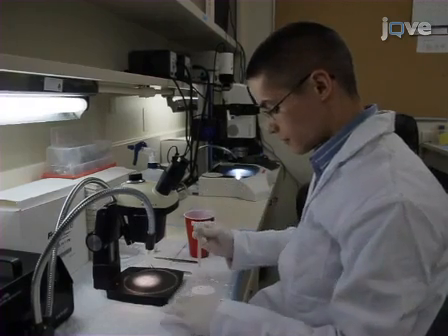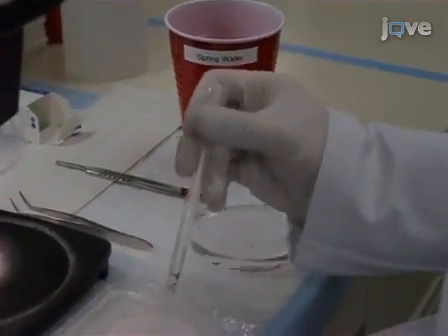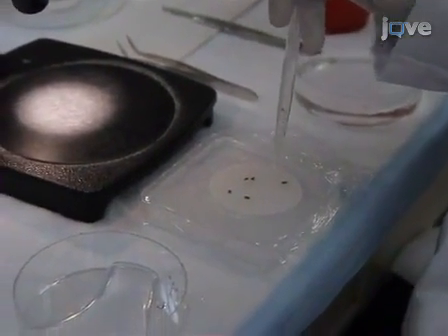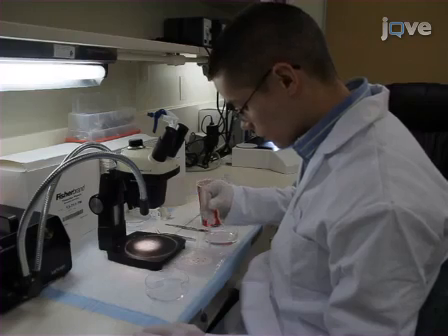Moisten the filter paper with a few drops of spring water. Using a transfer pipette, place no more than 20 planarians onto the filter. If necessary, the worms can be repositioned on the filter by re-pipetting with more spring water. Once the worms are in position, remove any excess fluid.